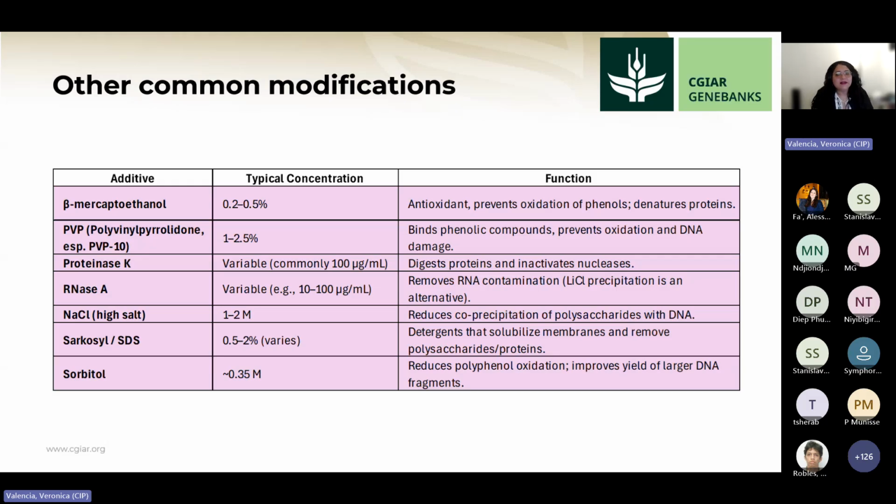It helps a little, but we didn't manage to standardize it to have great quality. It was just good enough, close to good enough. So the kit for oxalis works very well because it has a cleaning step that works very well.